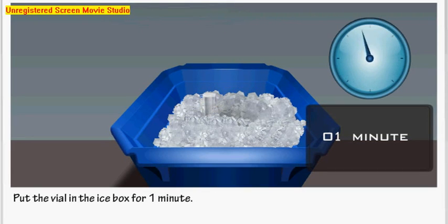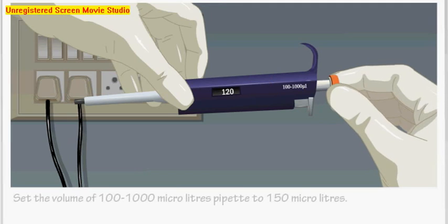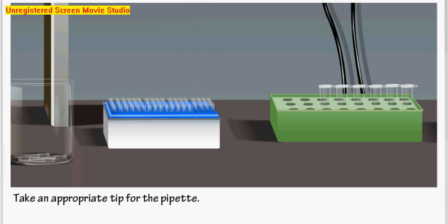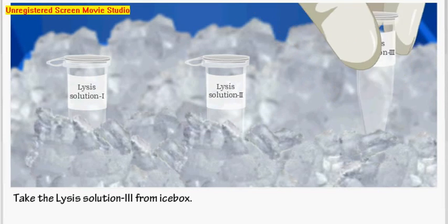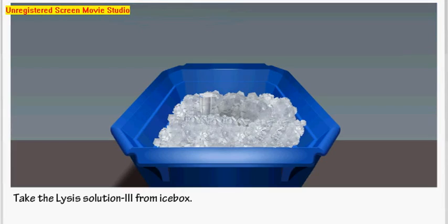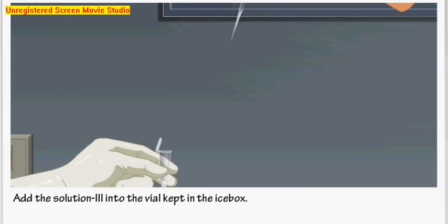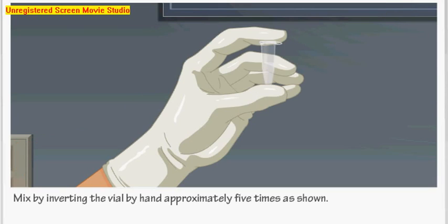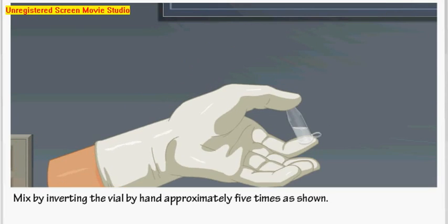Set the volume to 150 microliters. Take an appropriate pipette tip and take Lysis Solution 3 from the ice box, then put it back. Add Solution 3 into the vial kept in the ice box. Mix by inverting by hand approximately 5 times. Store the vial in the ice box for another 5 minutes.